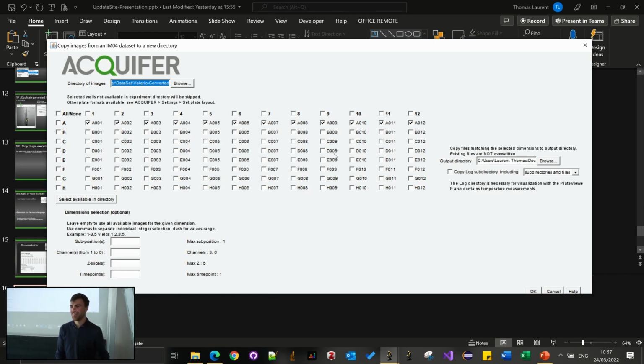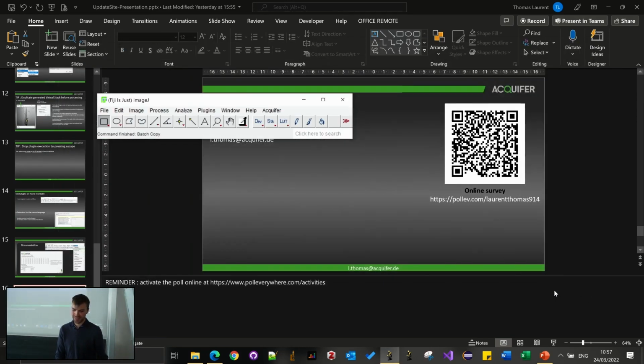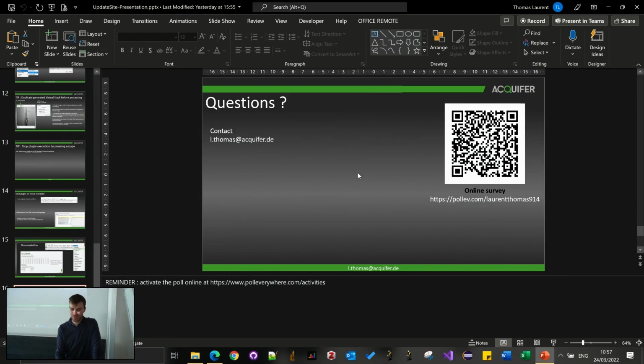We connect remotely to our imaging PC, and so you have a window like that, and we are struggling to just find the button. Yeah, okay, sorry. Or if you don't use the full plate, you can use another plate layout, so it's reducing this window size. I don't know. But I had this issue also sometimes when testing the plugin. So fortunately, I don't have a quick solution for that.